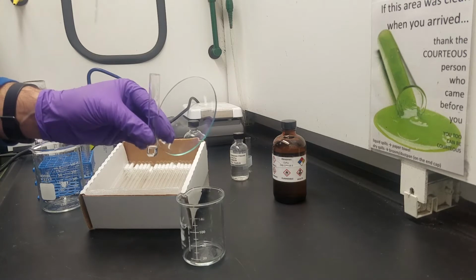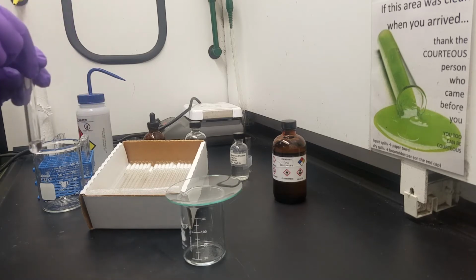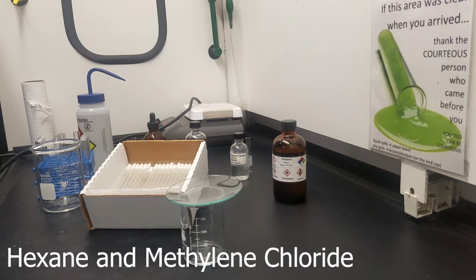In our last test, we're going to do our hexanes, which takes a little bit more effort because of the extra equipment there, and methylene chloride, and we'll see that pop up here in a second, describing what we're mixing. Same deal, we'll do the flicks, make sure they mix, make our observation, and then we're done.